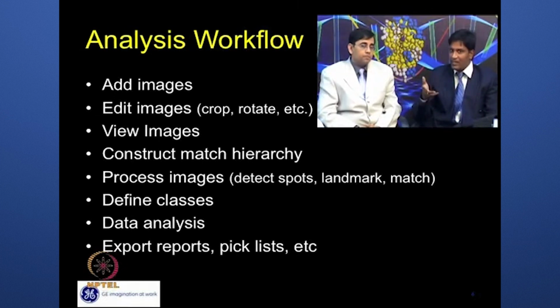Then processing gel images, where we can detect the spots and edit those spots, like whether these are the original spots or some dust particles, or if a couple of spots are showing as a single spot, in that case we can edit that spot. We can split them into two different spots, and if somewhere the boundaries, the software itself gives very nice boundaries. If you are not satisfied with those boundaries, you can easily draw whatever boundary you would like to draw. Then data analysis.